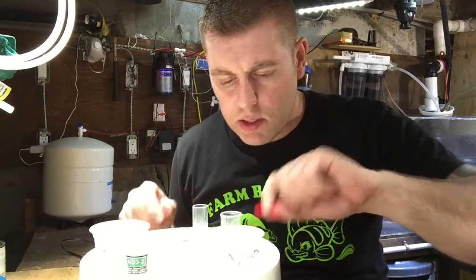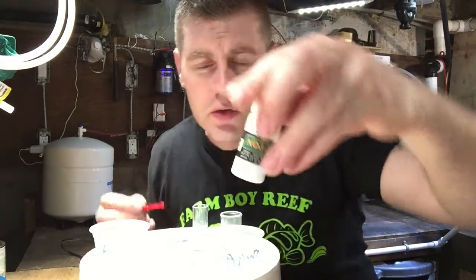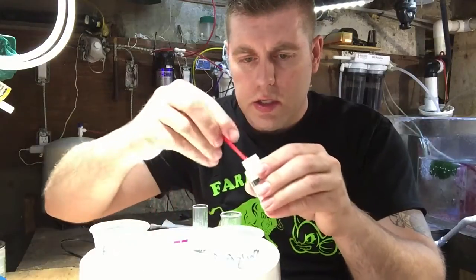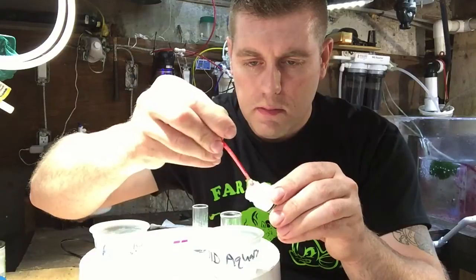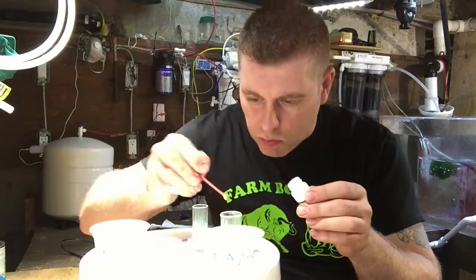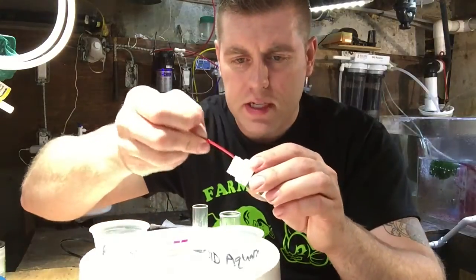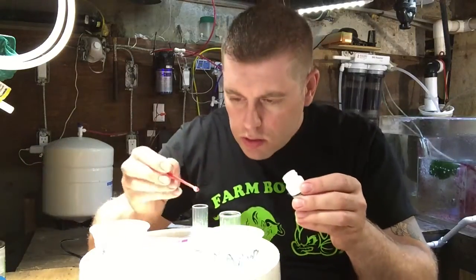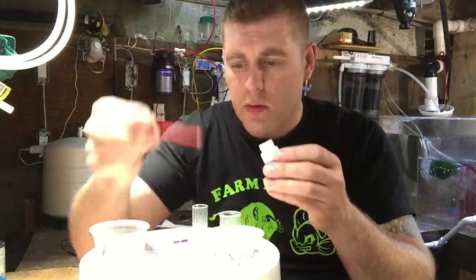Next, take the little scoop and take one level scoop of the NO3-2 powder for each vial. Put it in and rub it against the side to make it even. There we go — one for each test subject. This way you can see the difference between dirty water and when your reef tank is really doing well. Put the cover back on so we don't spill it.